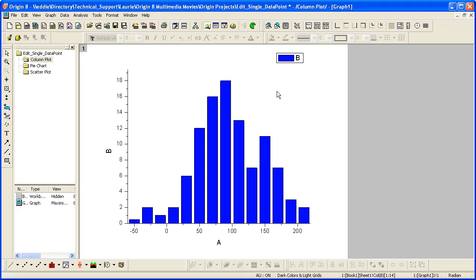And now if I wanted to choose this particular column and set the color as red, I hold down the control key and click on it, which will just select that one column.